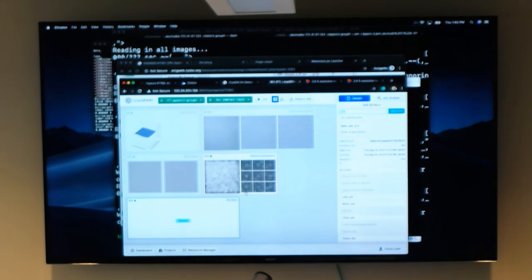You would first apply CTF correction, because if you don't apply it when you merge data at different defoci, you're going to be merging and mixing phases, and then you'll be limited to around the first zero, which would be in the order of nanometers. So that's great for class averages. For negative stain you don't even need it. So if you're doing negative stain in Relion, then don't bother. But if you're doing cryo data, you would definitely need to CTF correct. I mean, you would have to estimate at some point and then correct.